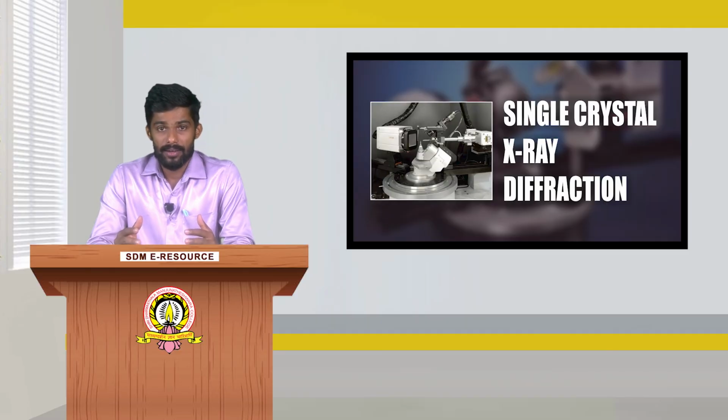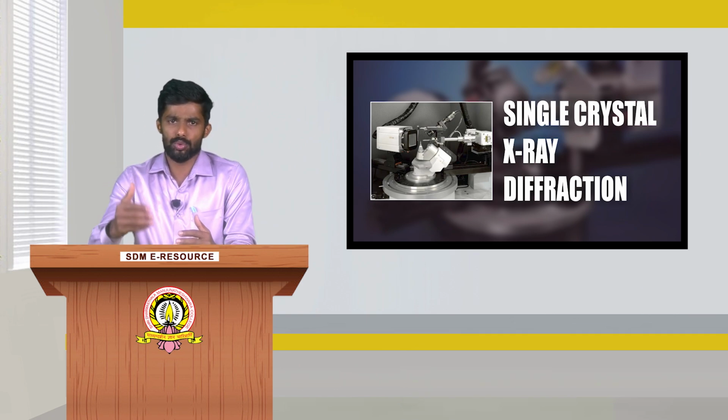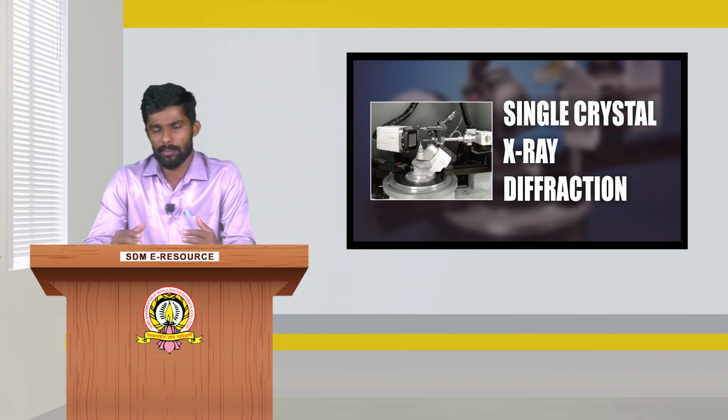So hello everyone. In the previous sessions I have discussed the powder X-ray diffraction techniques and the powder photographic methods. In this session, I will be discussing the single crystal X-ray diffractometer. As I mentioned in the previous session, X-ray diffraction mainly has two different types of registering X-rays, based on the samples handled.